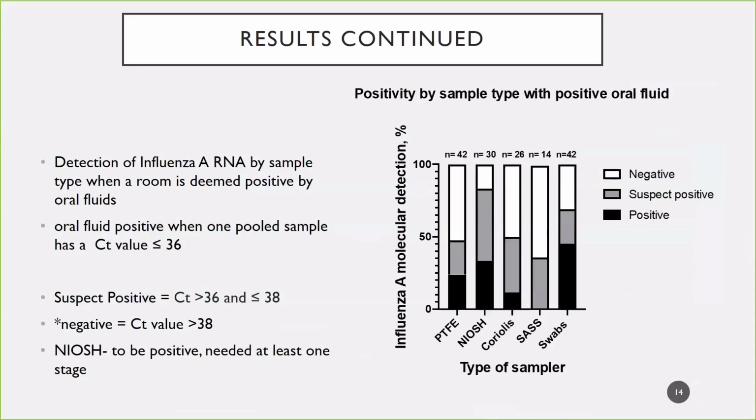Here we're looking at the positivity by sample type with a positive oral fluid. As I mentioned before, the oral fluids are a positive control to determine if the room was positive. Along the x-axis, you have the different air samplers as well as the swabs. The black bar is the positive samples, and the gray bar is the suspect positive, again based on the CT value of 36 as our cutoff. For the air samplers, we have a lot more suspect positives than positives. So even in rooms where we knew there was influenza A virus, we weren't always able to pick it up in the air or in the environmental swabs. Next slide.